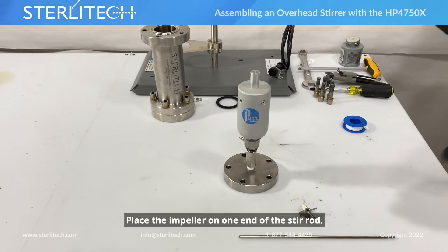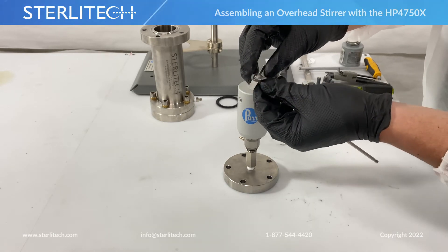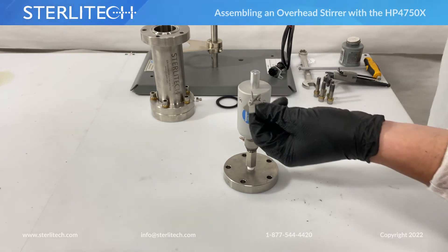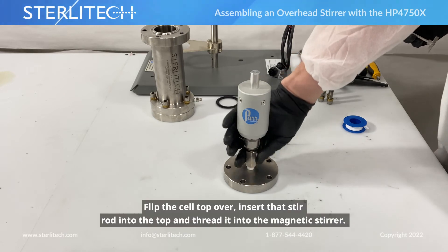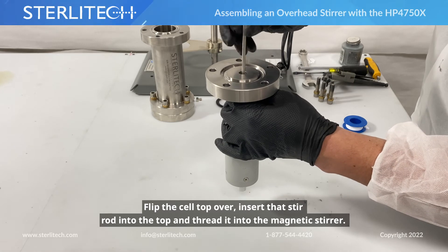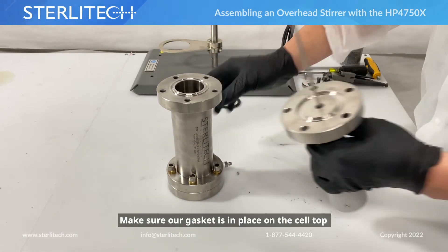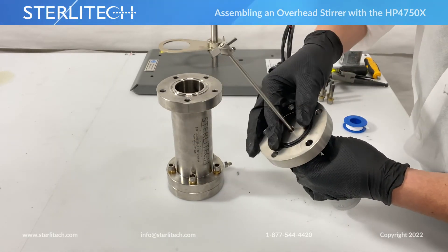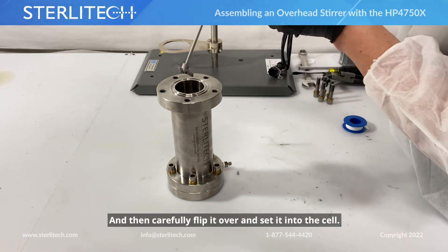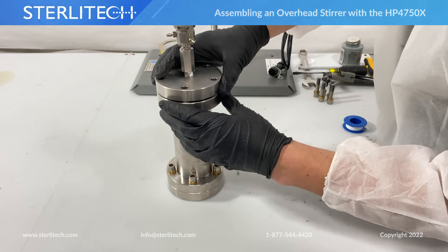At this point we can take our stir rod. We're going to be placing our impeller on one end of the stir rod, setting it in place by tightening the set screw using a flathead screwdriver. From here, we're going to flip our cell top over, insert that stir rod into the top, and thread it into the magnetic stirrer. Then make sure our gasket is in place on our cell top, and carefully flip it over and set it into our cell.